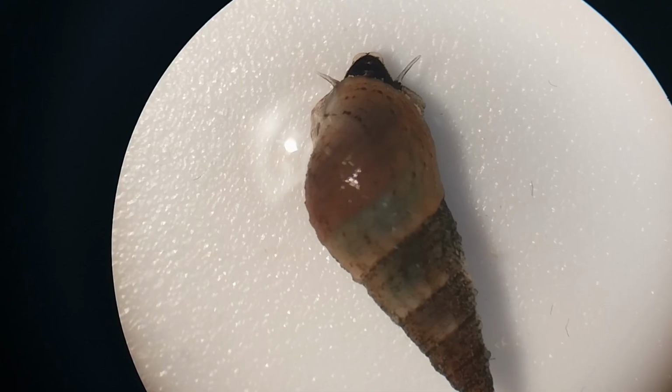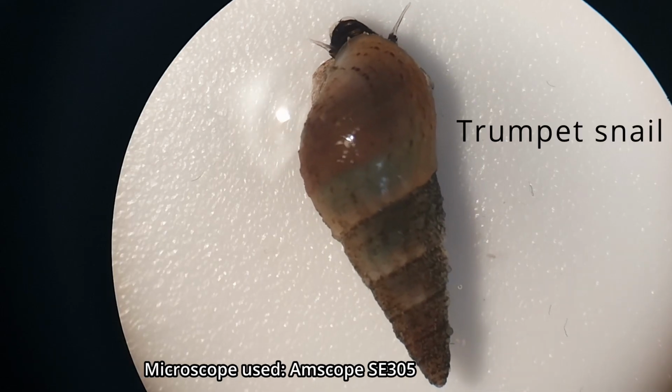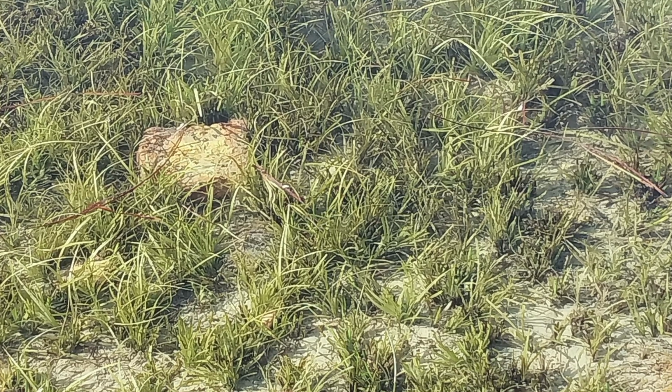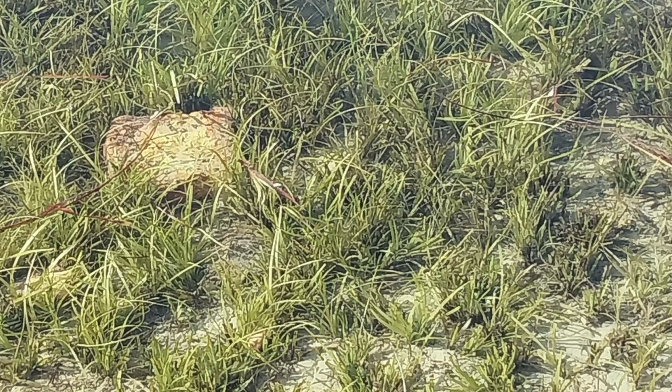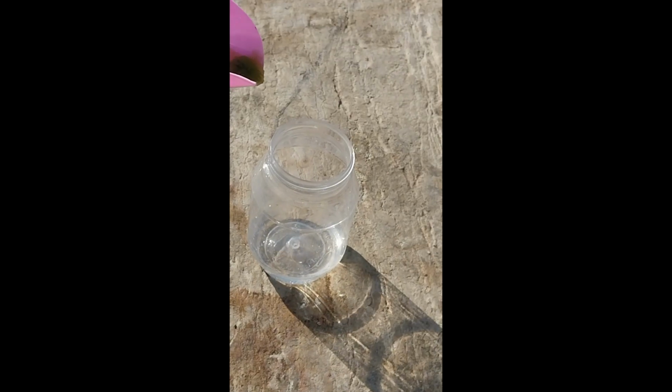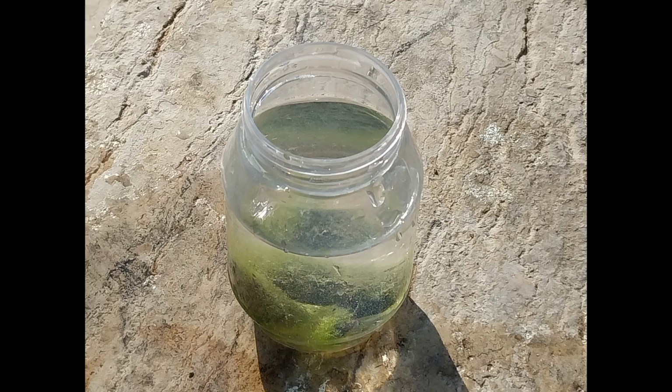This is a freshwater sample, and this is a trumpet snail under the microscope from that freshwater sample. In this video, I'm going to show you how I collected these samples and what I found when I put them under the microscope. I attached this plastic shovel to a selfie stick, and I used it to collect a wall of macroalgae.